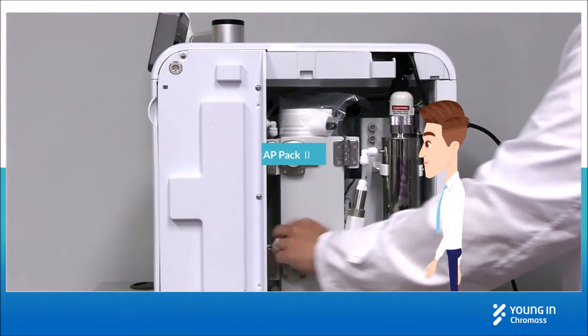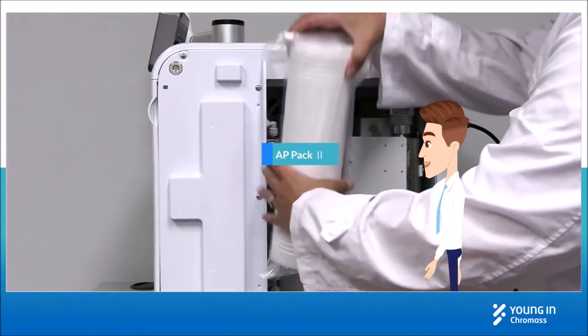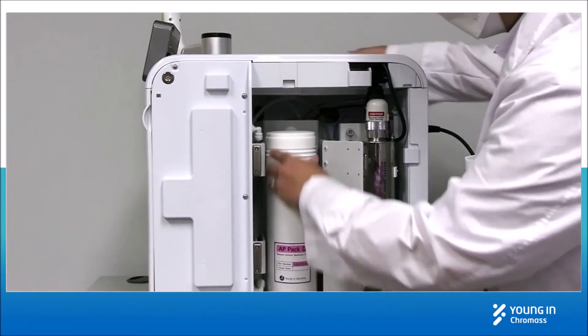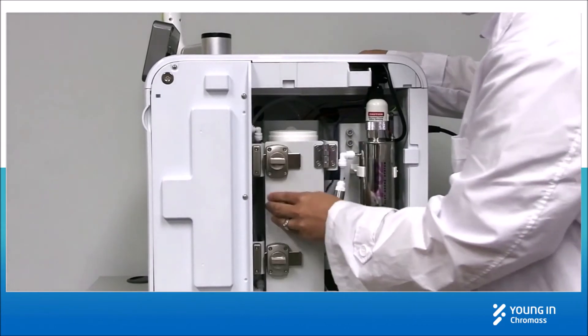Open the side cover and install the AP Pack 2, same as the filters in the front. Make sure you lock the filter bar.